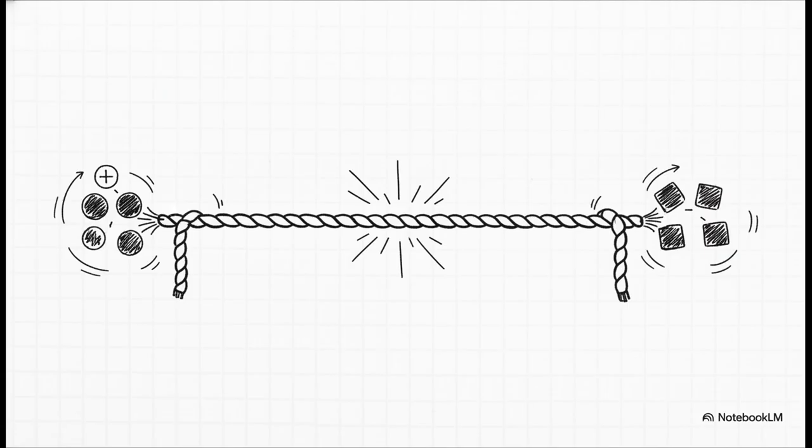In fact, the entire elution mechanism, meaning the way compounds are pushed through the system at different speeds, is based entirely on the displacement of ionic equilibria. Basically, the mobile phase's background ions are constantly competing with our sample ions for space. It is this dynamic, microscopic chemical tug-of-war.